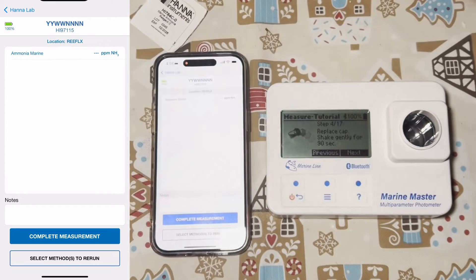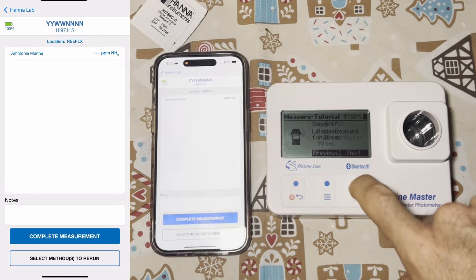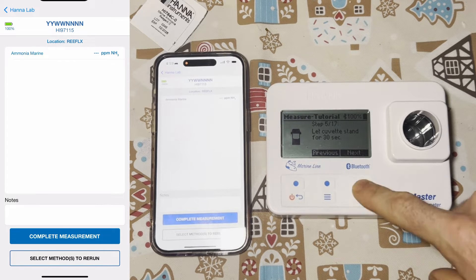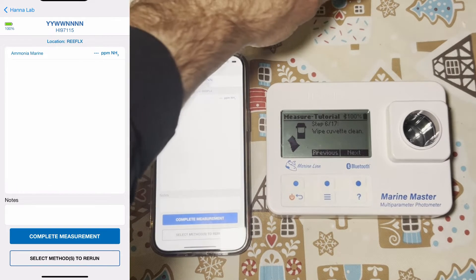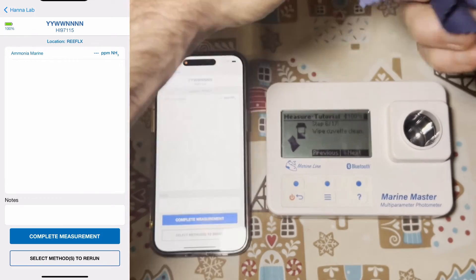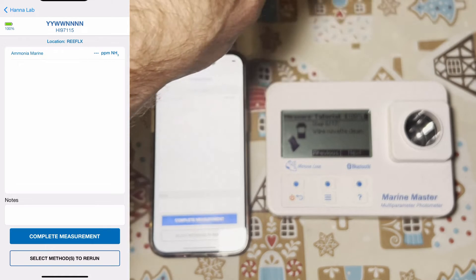Now it wants us to shake and mix this thoroughly for 90 seconds. Done. Next, let the cuvette sit for 30 seconds. Then I wipe the cuvette clean with the included microfiber cloth.